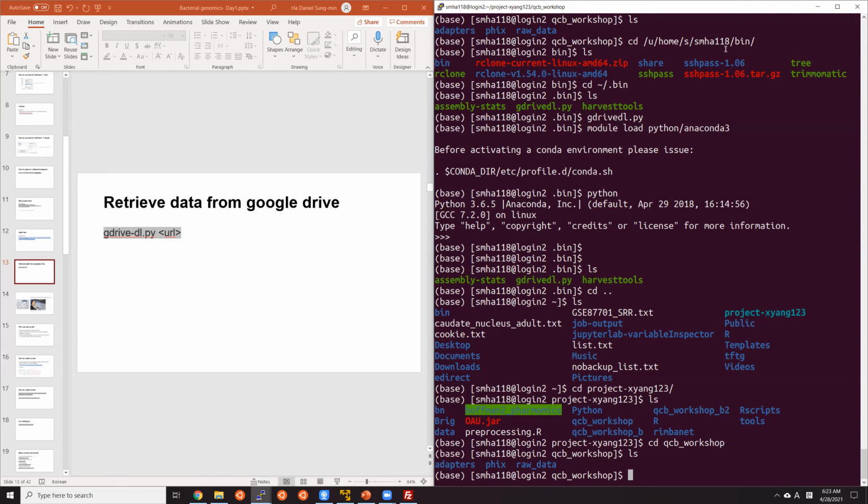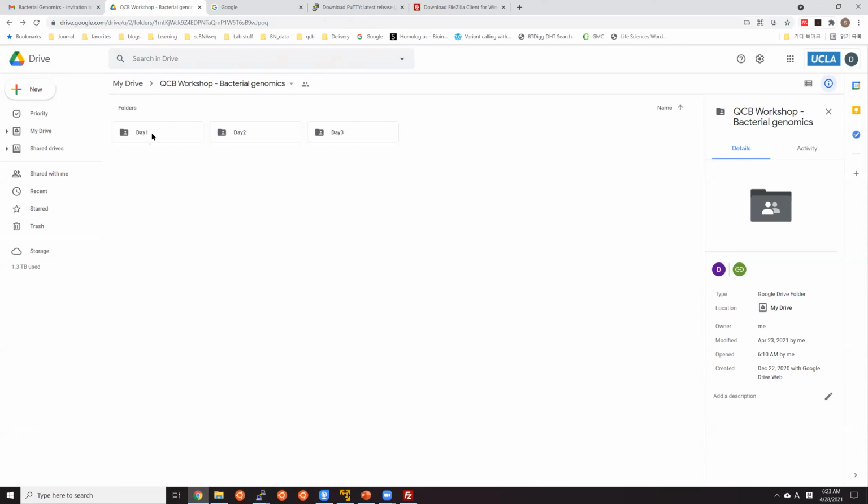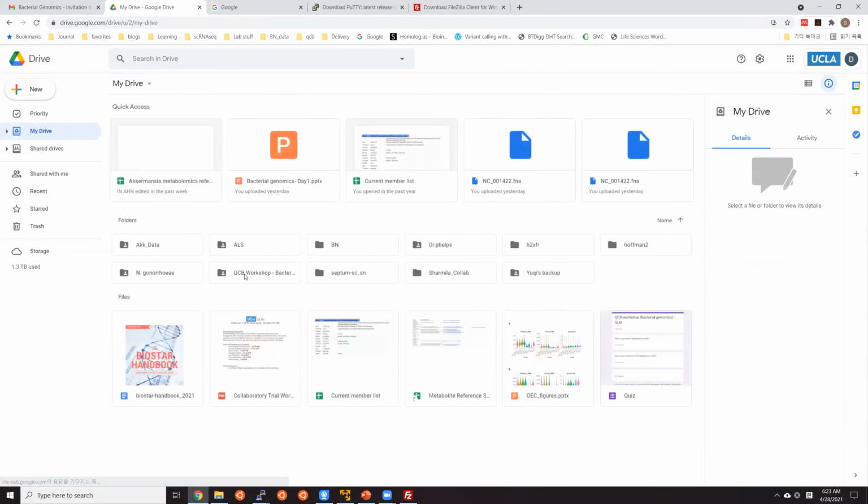Sorry, when I do that, I don't get the adapters output. I just get some errors, like value error, zero length field name in format. One sec.